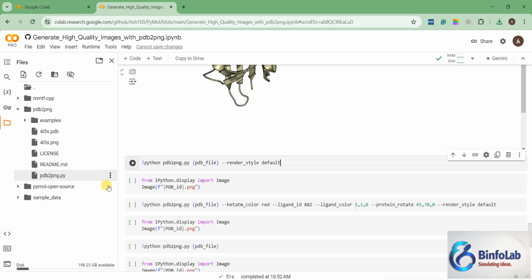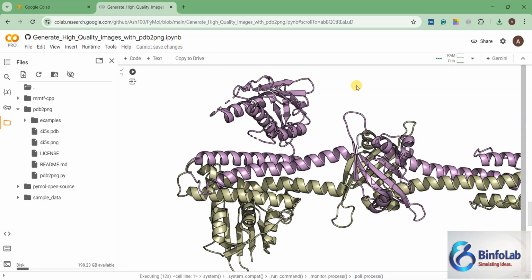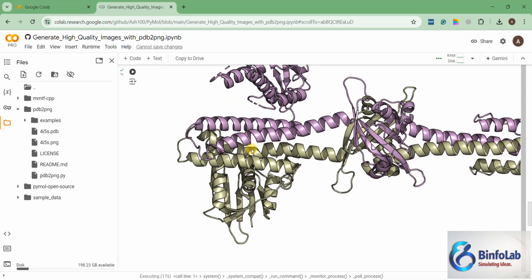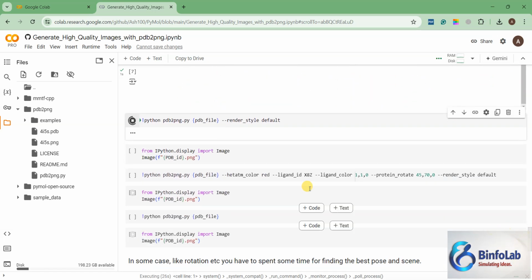Okay, I will remove this and will save again. I will teach you how you can tweak or change such kind of things. First, let me show you that yes, we can save these kinds of images in our workspace, or quickly for our presentation and tutorials. Okay, what I have done, I have removed the BW option here.